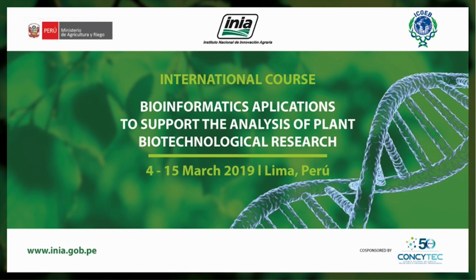We're not going to do that. We're not forcing the alignment to go in a specific pathway. You're just letting the alignment do its thing. Because right now we don't know anything about these sequences. That's our assumption. This is the first time we're seeing these sequences. For some reason they look alike in BLAST, and we've downloaded them, and we're trying to see how well they align to each other.